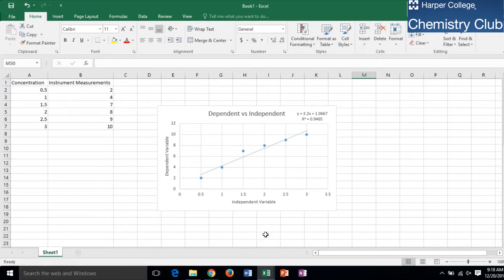The independent variable is what is being changed and controlled and is graphed along the x-axis. The dependent variable is what is being measured relative to the controlled changes being made and is graphed along the y-axis. Each data point is a sample of the known value.